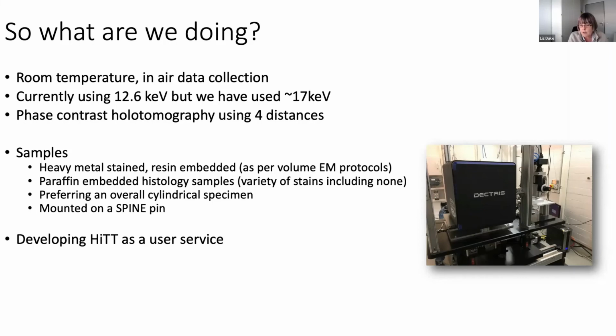And we're also exploring the sample mounting, the sample preparation protocols required. It's very nice. We can use a lot of the volume electron microscopy, heavy metal staining, resin embedding protocols, but we're also working with histology samples, which are paraffin embedded. And in fact, we've got some beautiful data from samples where we've used no staining at all. So it's the phase contrast that you get simply from the structures within the tissue is incredible.